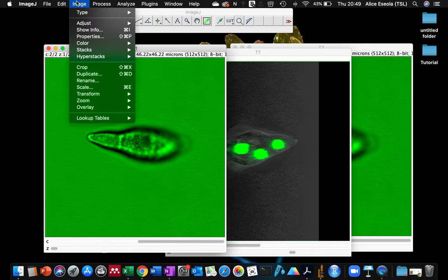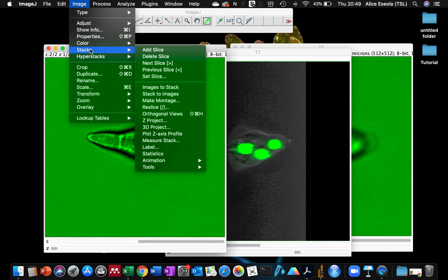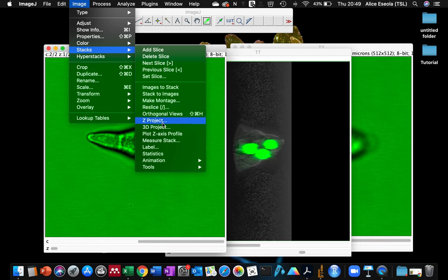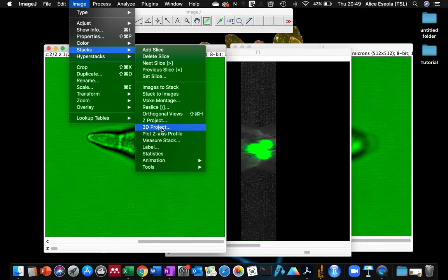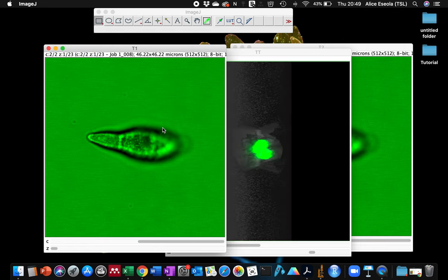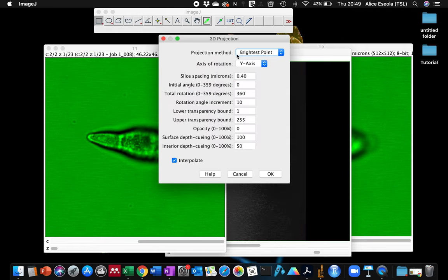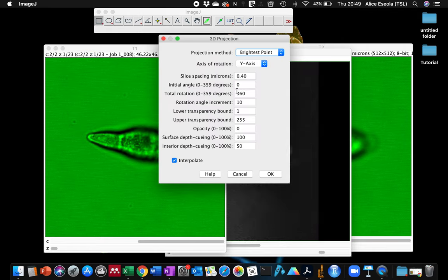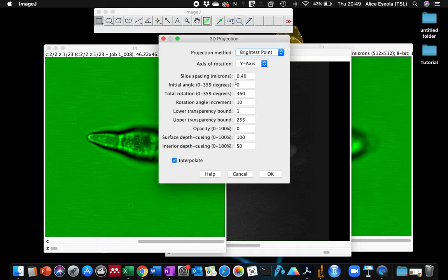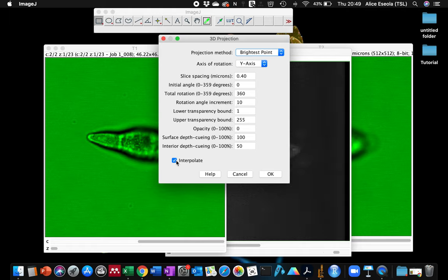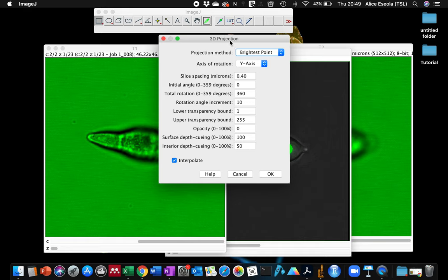You can go to Image, Stacks, and click on the 3D Projection. You can leave the parameters as they are and remember to take this interpolate option.